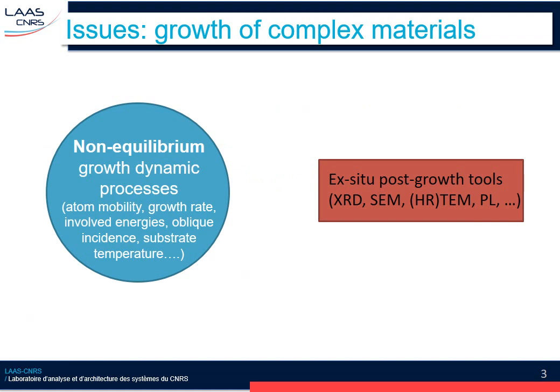During a growth, there are many different processes that will occur, and many will change during the time. What you can do after the growth to understand what's been going on is to do some ex situ measurement like X-ray diffraction or TEM, but this will just be an autopsy of your growth. I mean, you won't get access to every dynamic process with it.